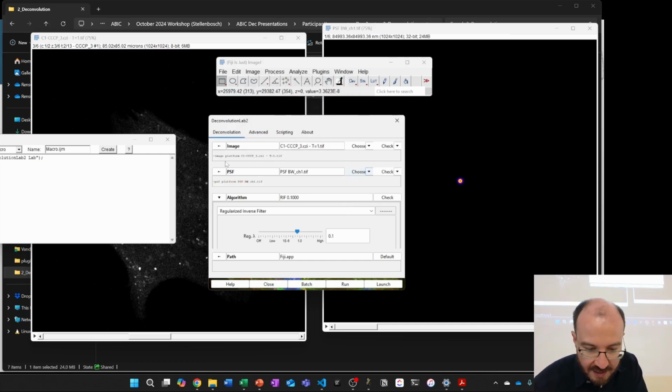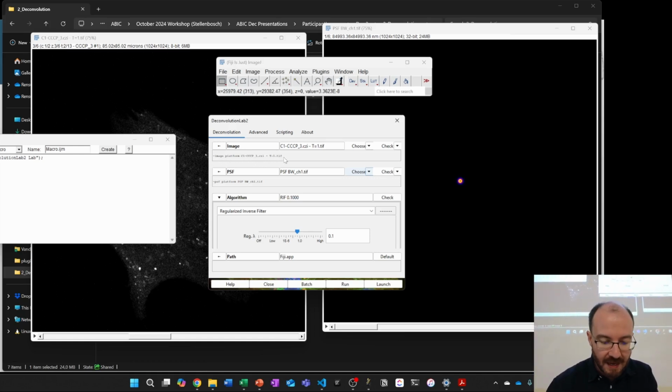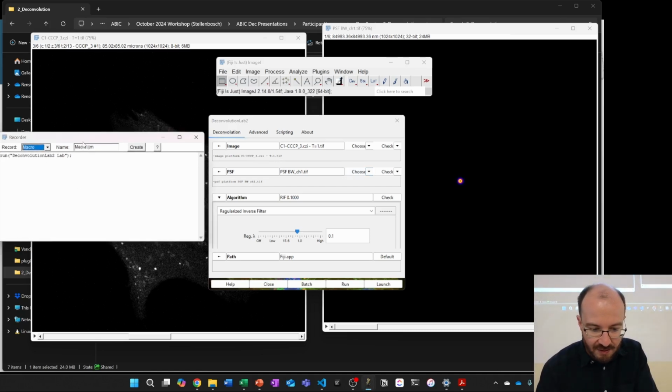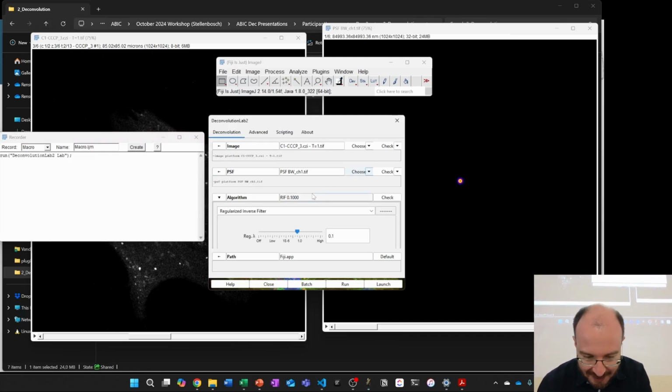And you'll see that there is actually some code that's generated at the bottom there. It's tiny on my screen here, but there is a little piece of code there that you can put into the macro. So that is macro code already, but we'll see, it should generate a macro on the side just now. Oh no, actually, I'll try to demonstrate how the macro code can be generated.